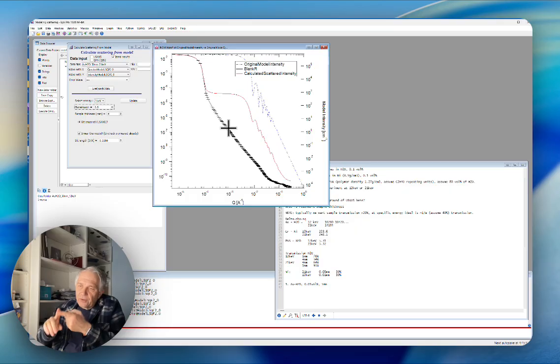After which you now know the contrast, transmission, and a sample thickness of your sample which you can live with. And then you go in the modeling tool and calculate small angle scattering on absolute intensity scale. You save that as a result of the model, and then you use the scattering from model calculator in the Indra package, in the USAXS package, and you use that to calculate the amount of scattering. How much does it stand up above the instrumental background? Once you have that, you know: can I see it? How well can I see it or not?